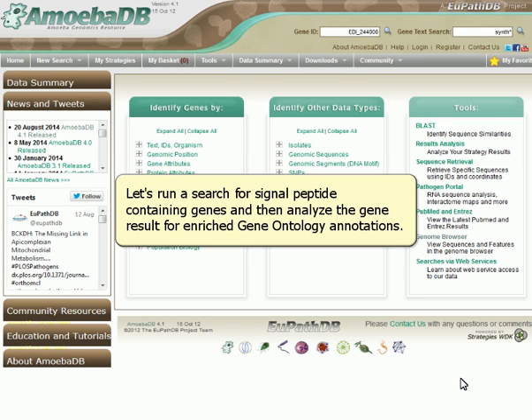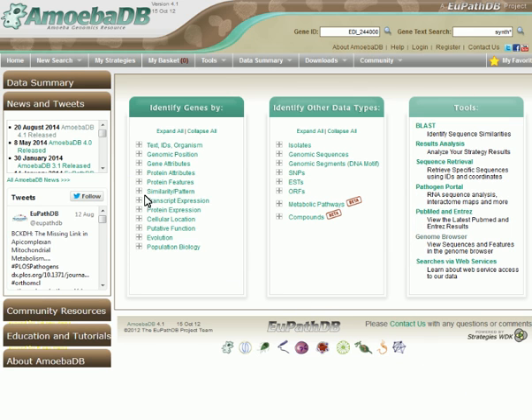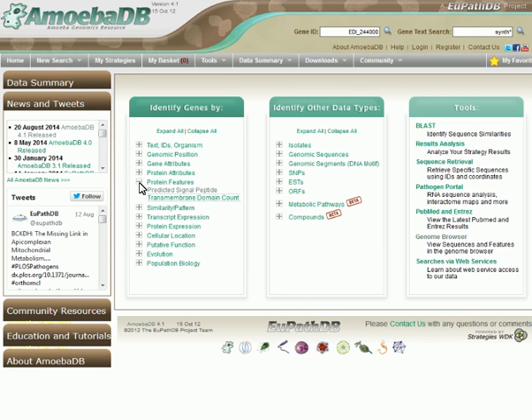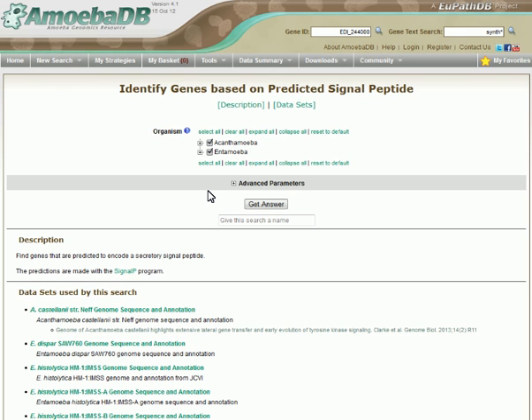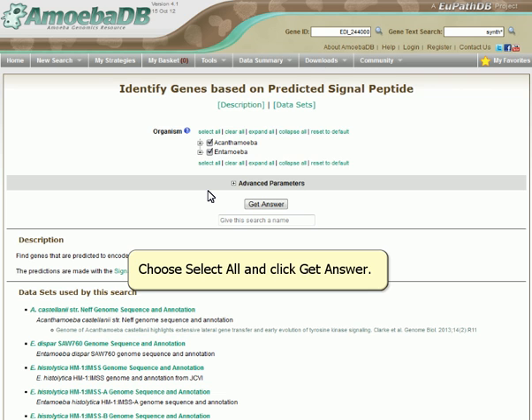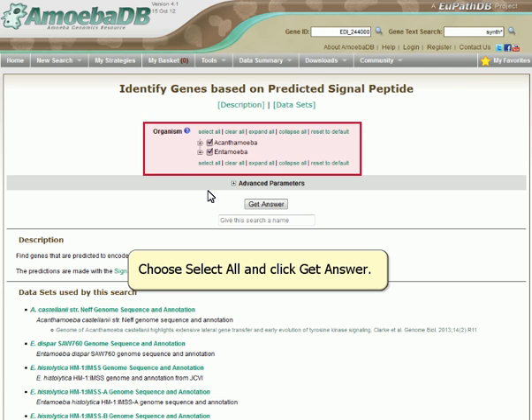Let's run a search for signal peptide-containing genes and then analyze the gene result for enriched gene ontology annotations. Choose Select All and click Get Answer.